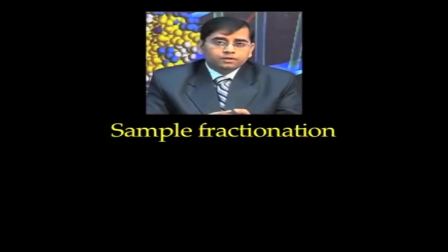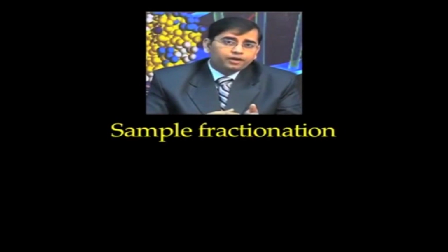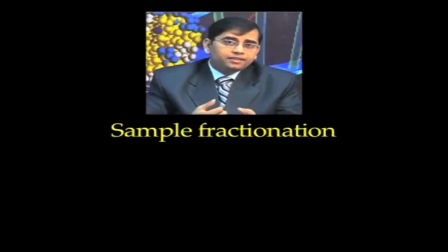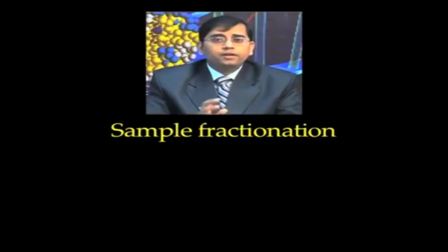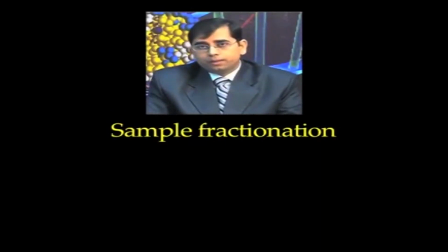Now, let us talk about sample fractionation. As I mentioned in the beginning, depending upon your application, you need to decide on a strategy, an effective way of obtaining all the proteins, so that you can study your biological problem effectively. For example, if you are doing a proteome analysis of a particular organelle, then you need to fractionate your sample.